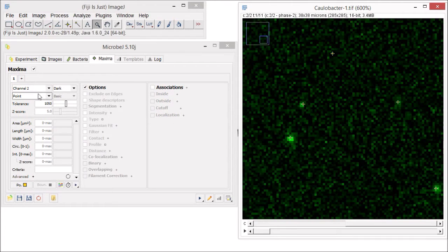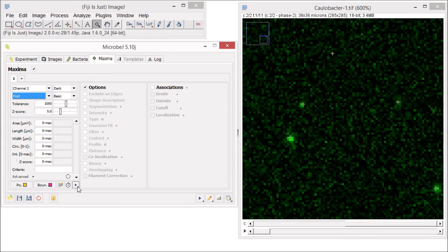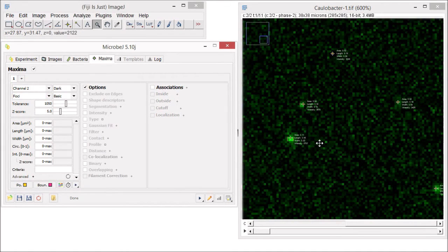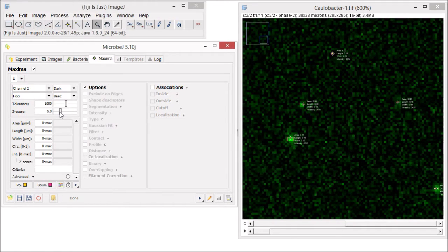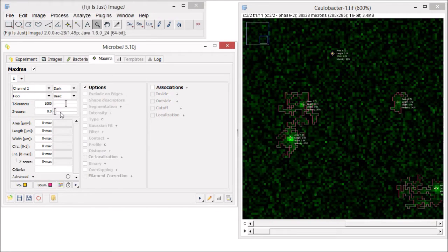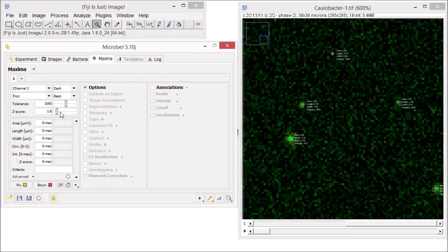So let's select foci as the detection mode and press the test button again. When you select the foci mode, MicrobeJ will not only detect the local maxima in our image, but also the contiguous area around them. To do that, we need to define a z-score, which basically defines how the pixels must be different from the background to be included in the surrounding area. Watch as I move the slider and change the z-score, how the surrounding area changes on the image. Try to find a z-score value that optimizes the area around your maxima, while keeping the distinction between what you consider as your foci and the background.